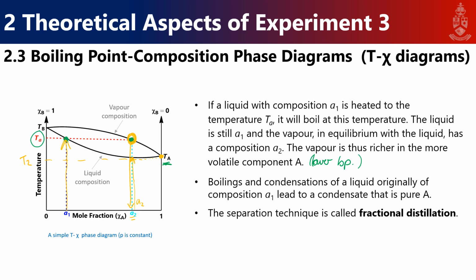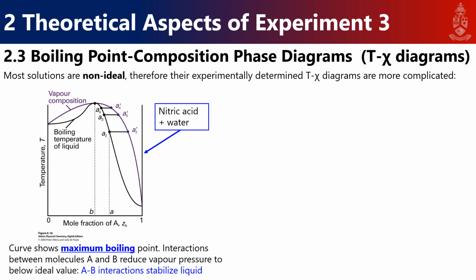So that just shows you by successive heating and cooling that you can separate your two liquids. You will do more of that in the theory module as well. And this technique is called fractional distillation. So if you're interested now and you want to read further, you can maybe just do an internet search on those keywords.